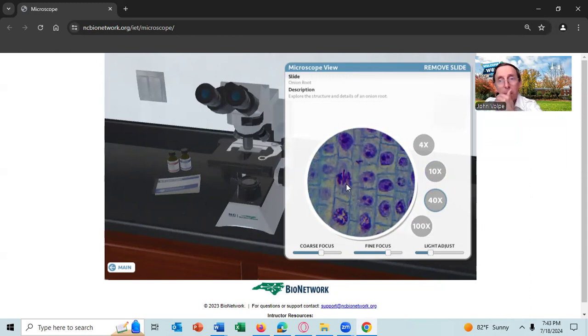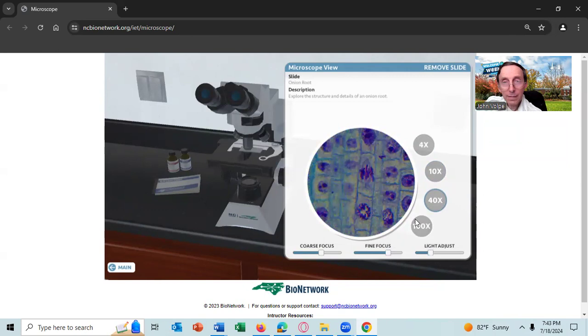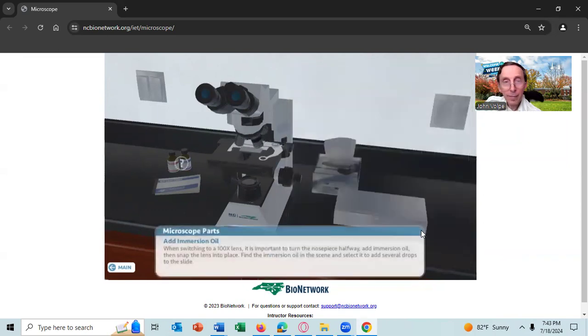There we go. So I'm going to ask you a question about chromosomes. I should make sure that question is in the lab, but hopefully it is. And if not, I'll add it to the lab. And then let's see if we can go up to the 100X lens. And you'll note we don't see anything here, and it's telling you to add oil, immersion oil, and there it is with the question mark.